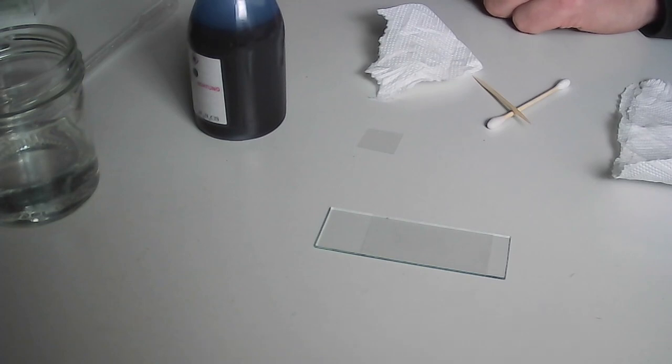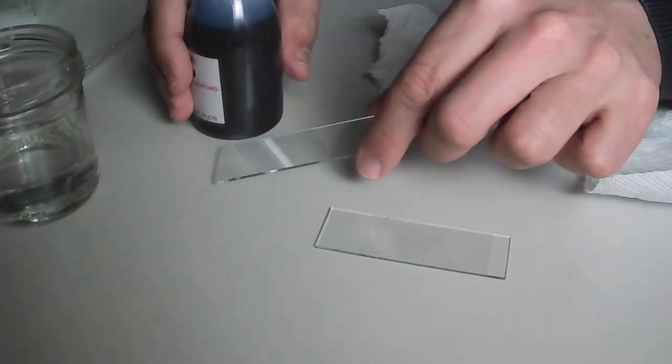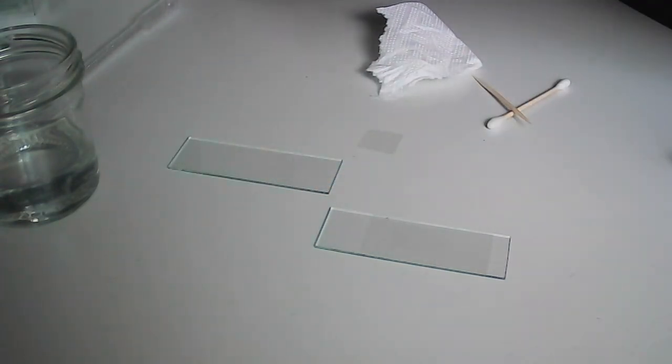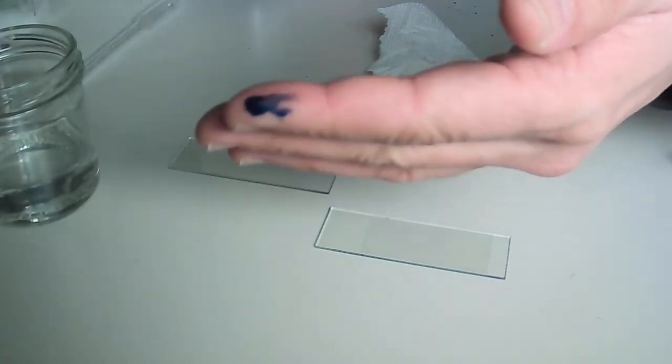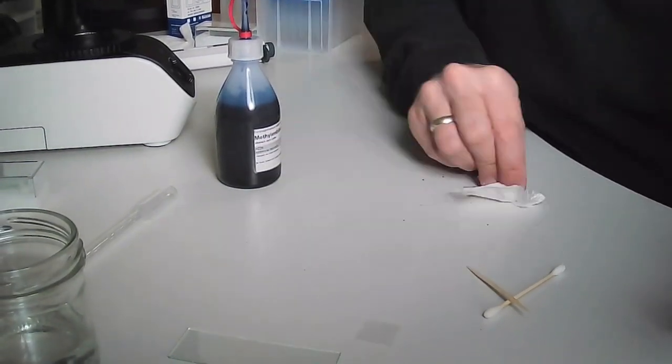So what I shall be doing is, and that's the thing, I don't have anything here right now. You know what I'm going to do? I'm just going to use another slide here because I want to be a little bit more careful with this. So I'm going to be using my other pipette. You can also use tweezers to do this. Ah, gee, this is what happens. Look, stain everywhere.